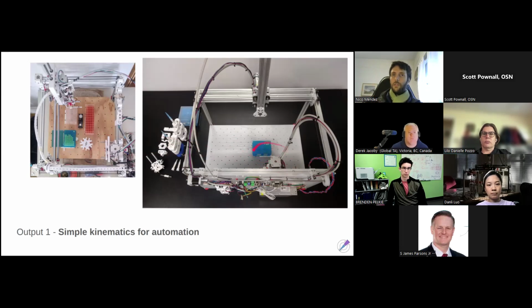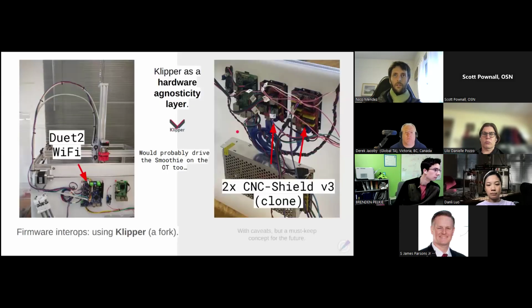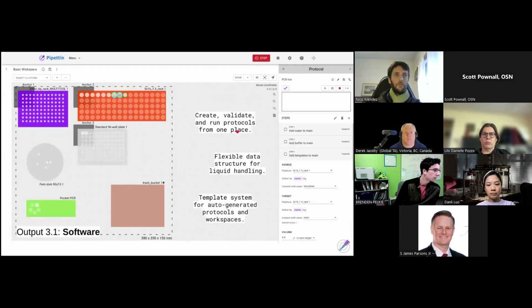You can, of course, change it, but you can also remove the entire base plate, which sits on the rod with a kinematic coupling, which is the same idea, actually borrowed from Jubilee, only that it's static. The idea is that you can remove it and then play around with it and then put it back or put it on another robot, and it will sit exactly in the same place as it was before, but the z-axis is free to move elsewhere. So there's a bit of manual work there through which you have to match the virtual workspace to the physical workspace. But once you do that, it's done.